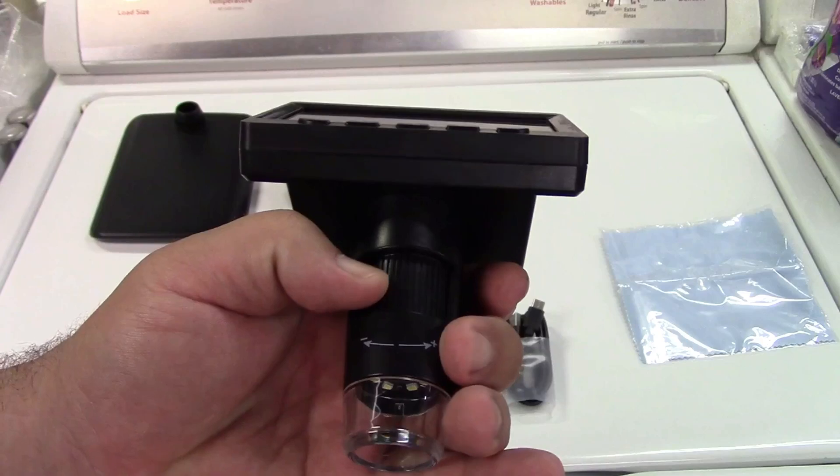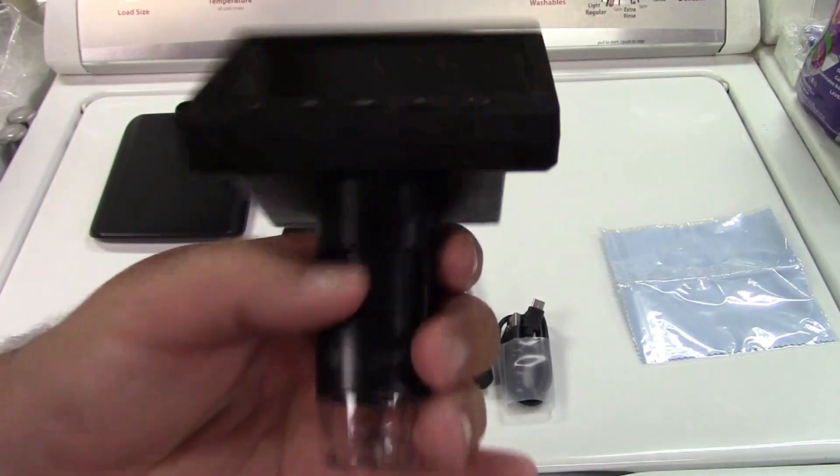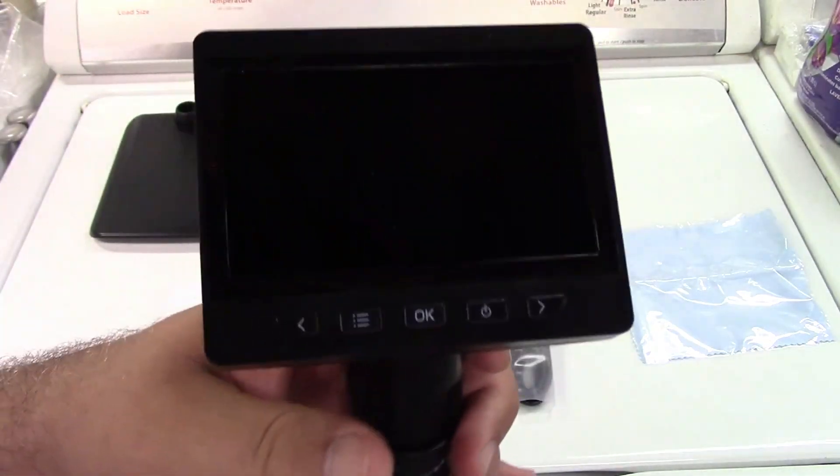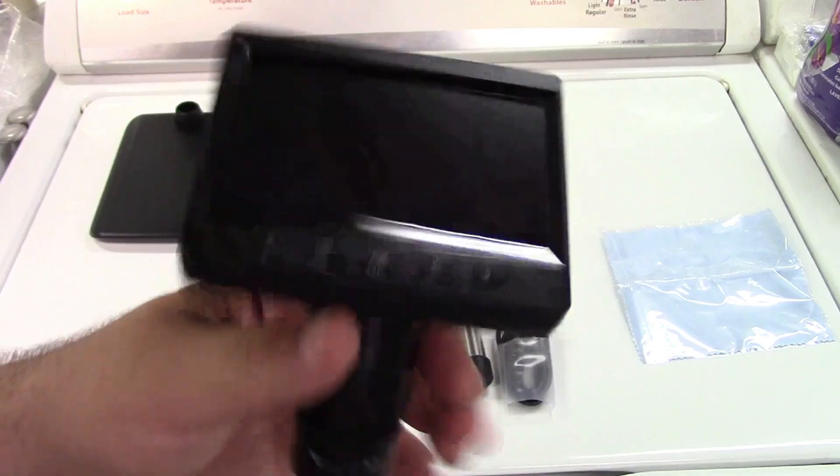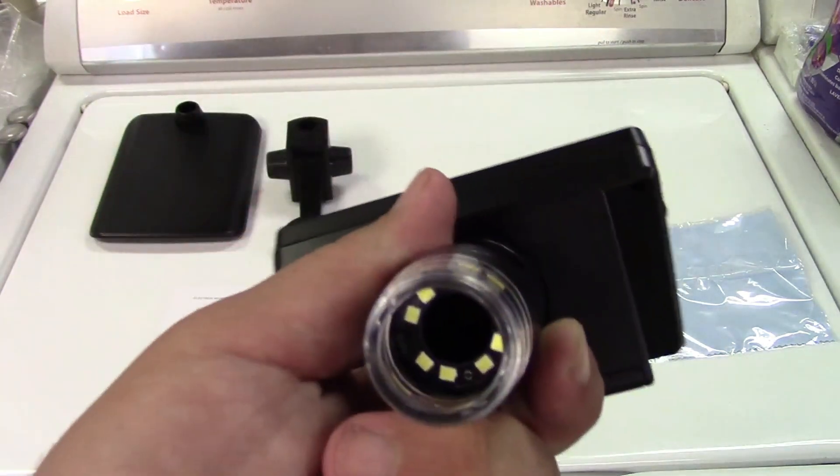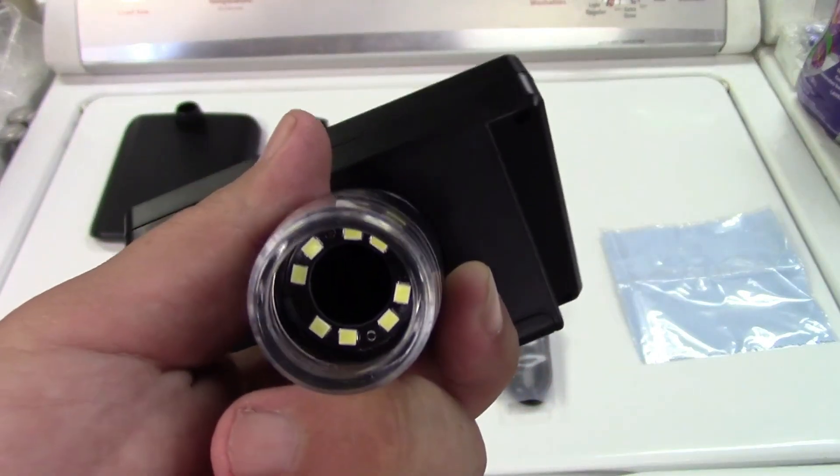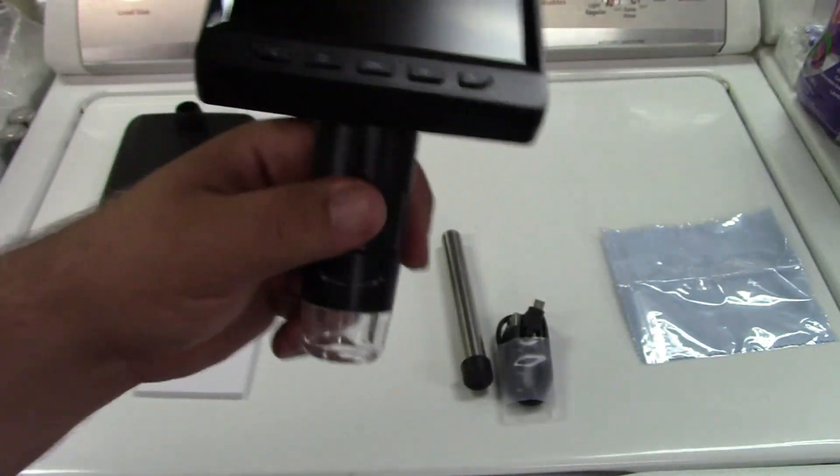It's in 1080p, you can lower that resolution down if you want, but there's no real need to in this day and age. And there are eight LEDs to illuminate the subject. We're going to see that in a bit.